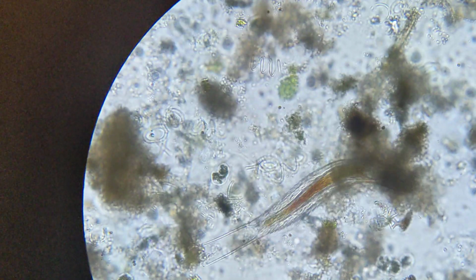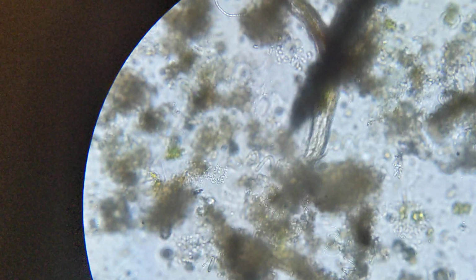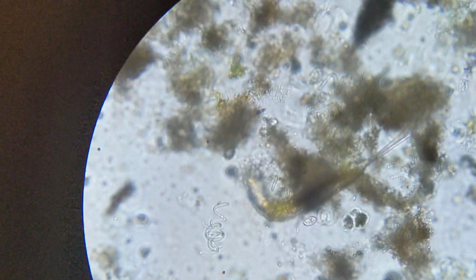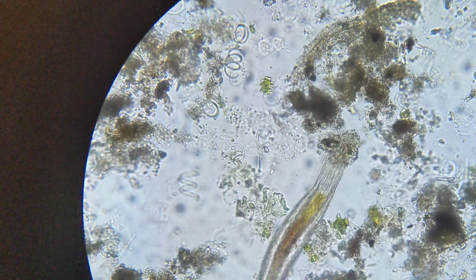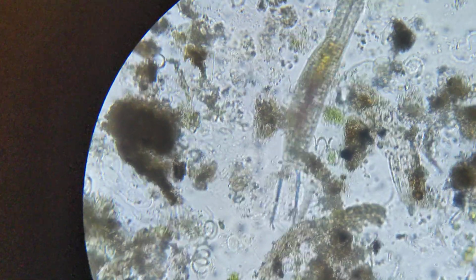Elsewhere on this slide, there was a ciliate of some sort in the middle of dividing, and I'm not sure if it's a Didinium or Colops or something like that. And part of me wants to go find it again, and part of me says that I've found it like 3 times, and each time I get ready to take a video it shoots off and I can't find it again.